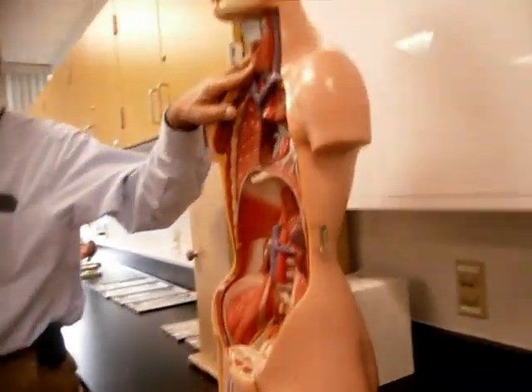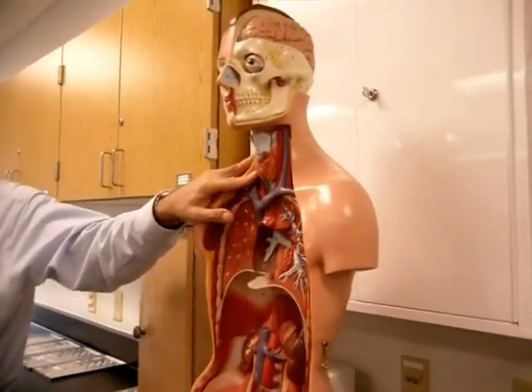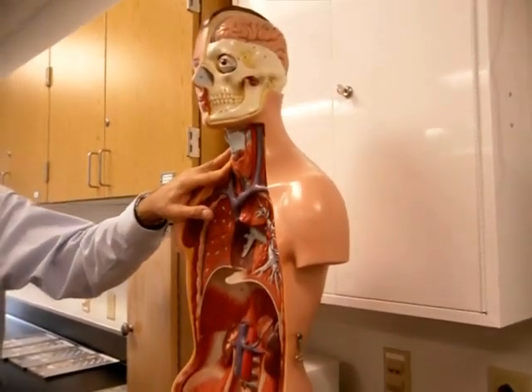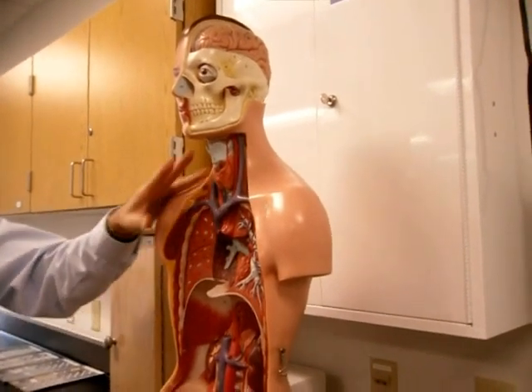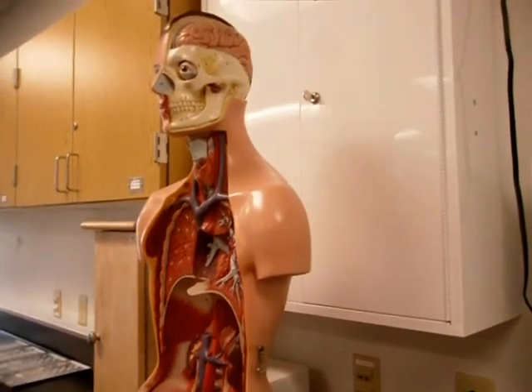What's this up here? This is the thyroid. Be careful. This is the thyroid. It doesn't show the thymus on this. This is an adult, and the thymus gets smaller and smaller with age. There's something else up here.